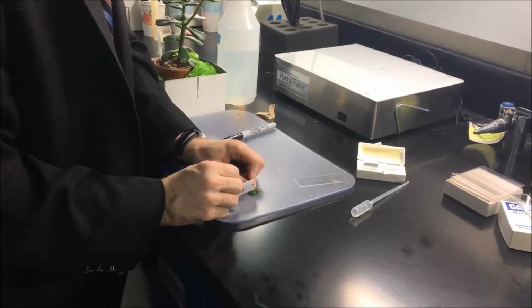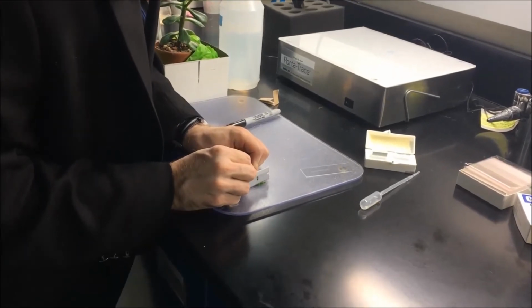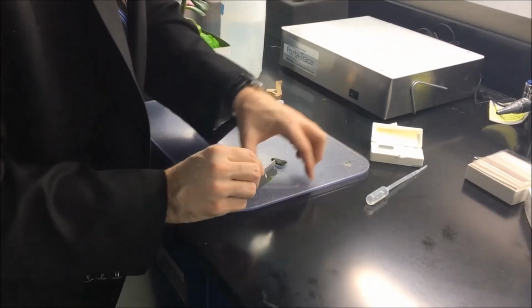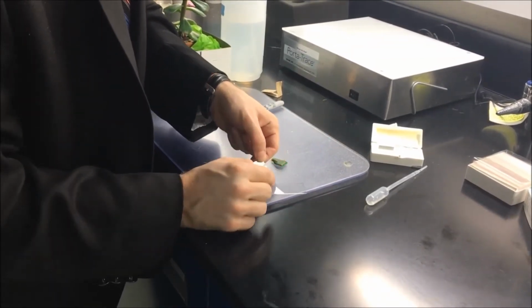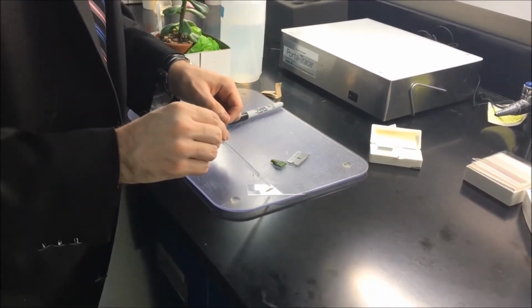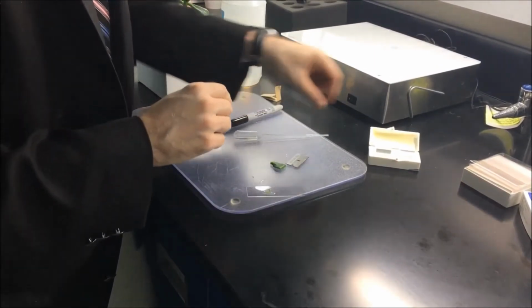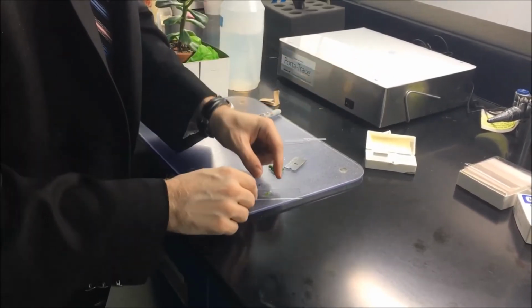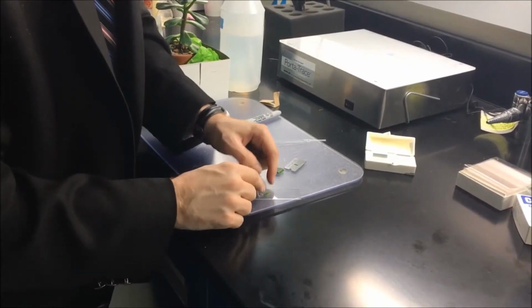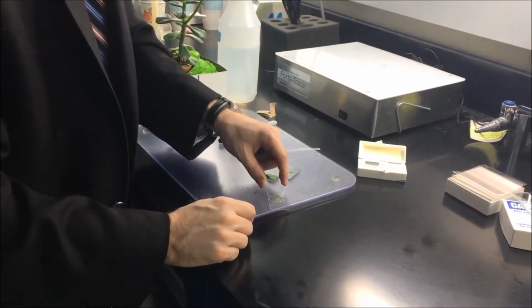We can take a piece of leaf here. Here I have a jade leaf, and very carefully we can cut a thin section of it. Push it onto a slide. Add a drop of water. And then take a cover slip. Add it on. Press gently. And then use the microscope to look for chloroplasts.